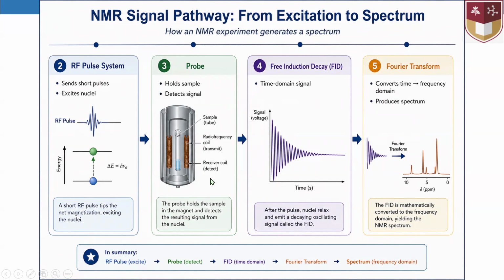They transmit radio frequencies, and there are receiver coils as well. So they transmit and receive, after resonance, some emission from the nuclei.